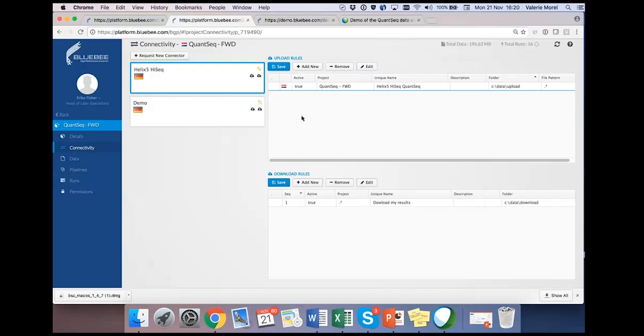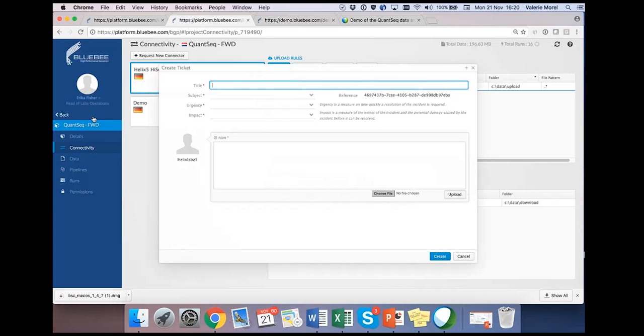This is from an operations perspective how things would work. There's a few little other things that I'm able to show you. First of all, if you are in trouble for some reason, you can always create a support ticket, and you will get in touch with our help desk. So you let us know what your problem is, and immediately and also through the same user interface, our help desk will answer your question.